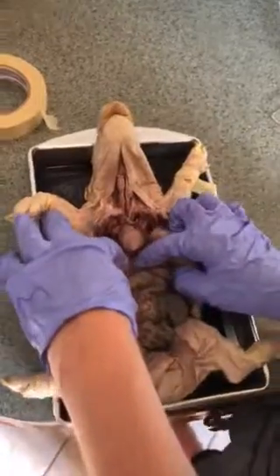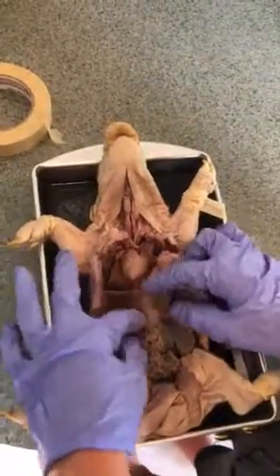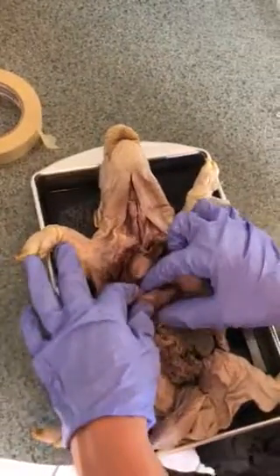We've also have, let's see, left ventricle, we did that. Okay, we've got the liver, which is this whole section up here.